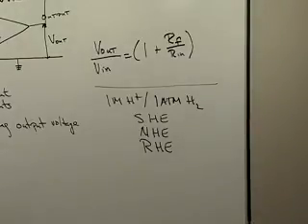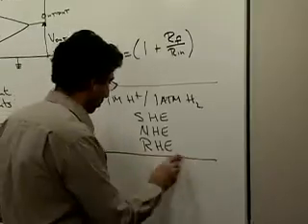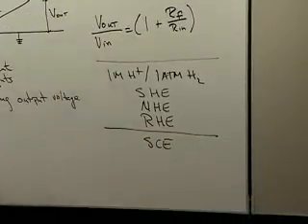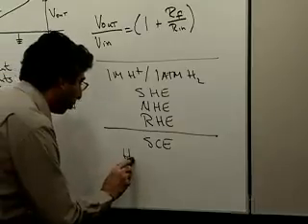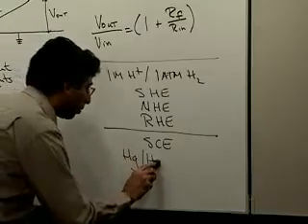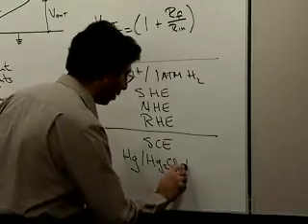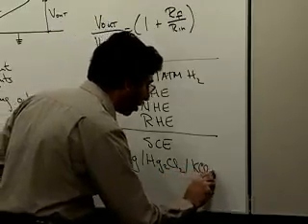Now, so what do you use? Well, probably the cell that most people use is the SCE, saturated calomel electrode. This is a mercurous chloride couple in saturated KCl, aqueous KCl.